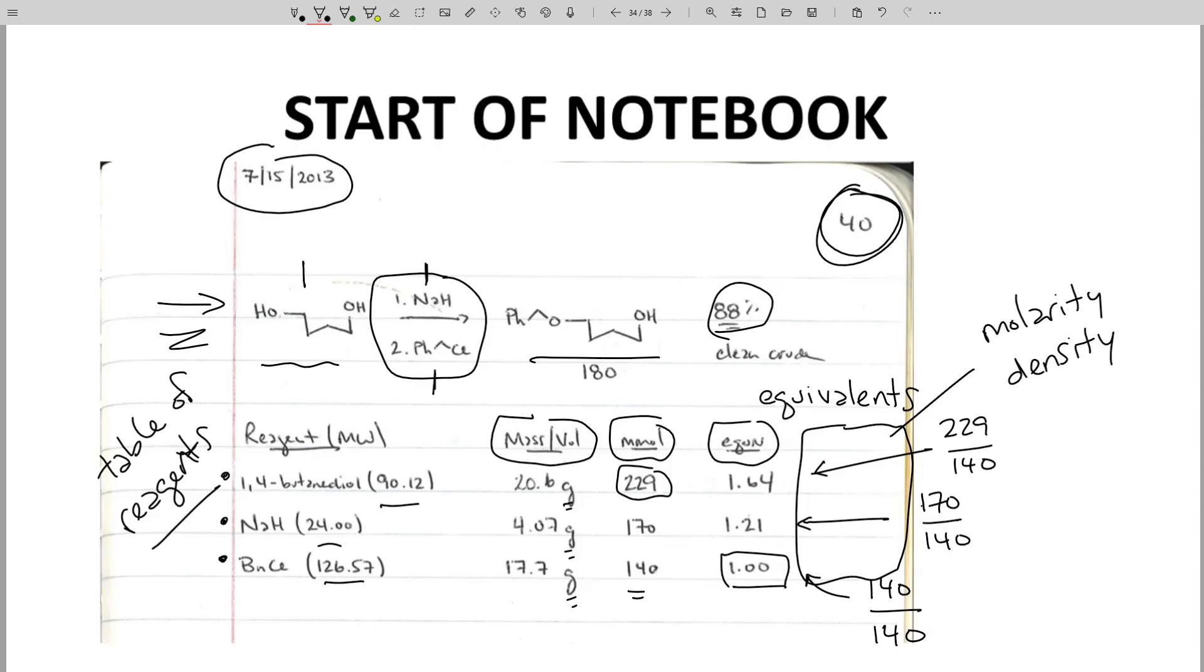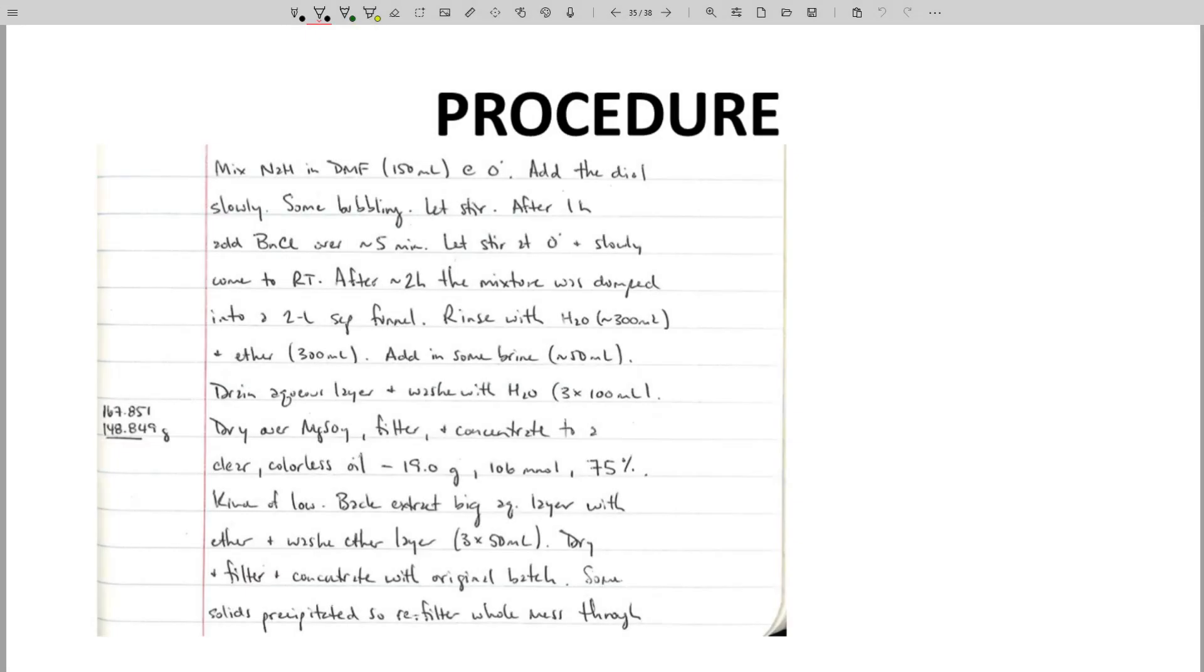Great. Now let's look at the procedure. Here is the bottom half of the previous page. Note that I like to write in prose. I just write a bunch of sentences to describe what I did. Some people like to use bullet points. Other people like a two-column format with an action observation style. All of these are fine, in my opinion. Your job in keeping a lab notebook is to make sure that you record enough information so that someone else could repeat the experiment and get a similar result to yours. That is a bit vague, but that is the point of keeping a lab notebook.